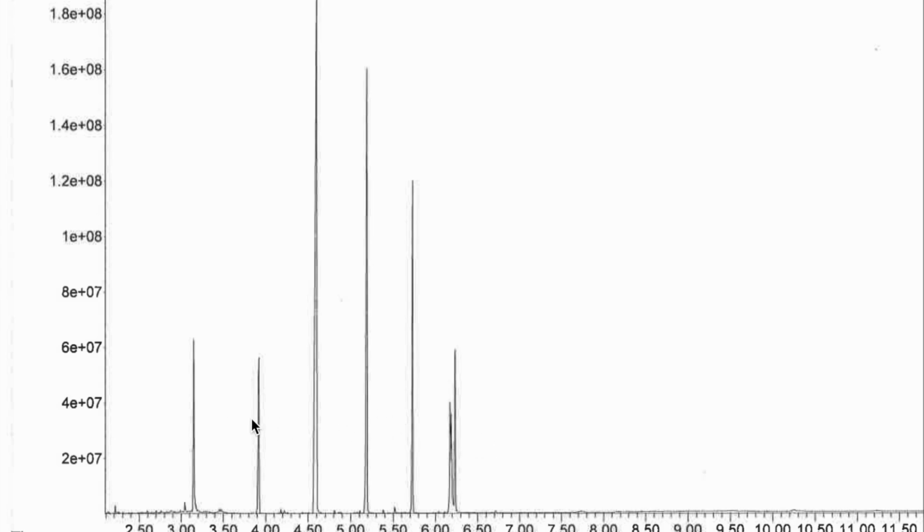So the column is separating this biodiesel into, it looks like about 7 substances, 7 compounds coming off, and that is not too surprising because coconut oil is not just made of one fatty acid. So when we make methyl esters of all the different fatty acids, we have several different ones that we can see coming off of the instrument. So these are all different biodiesel molecules, and the GC separates according to boiling point, which, since these are all similar types of compounds, pretty much corresponds to the mass. So the lighter ones are coming off first, the heavier ones are coming off last.